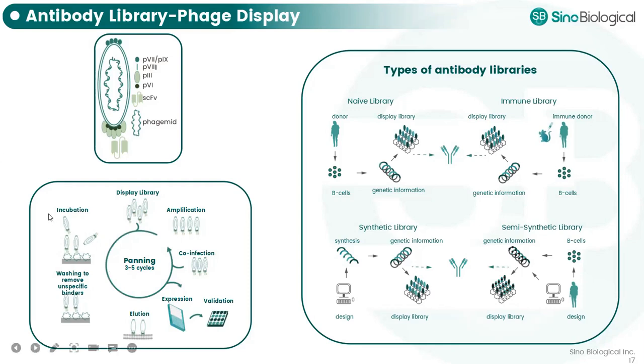So we incubate the phage display library with the target molecules, either coated on the plate surface or in solution. Then we wash to remove unspecific binders, followed by eluting the specific binders. And after these three rounds, we are able to obtain positive clones for future expression and validations.